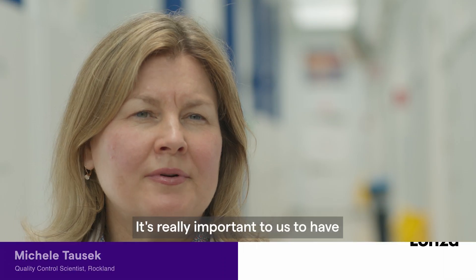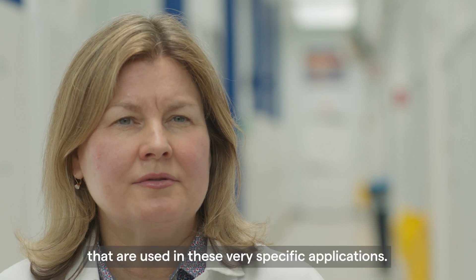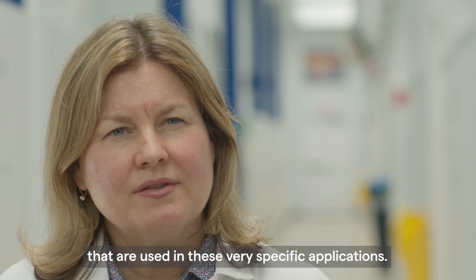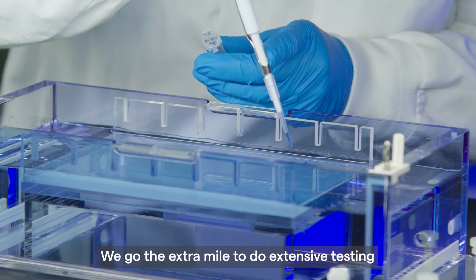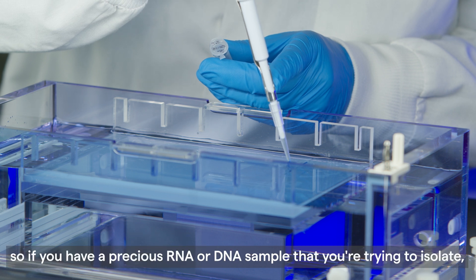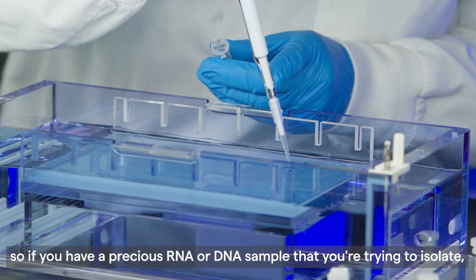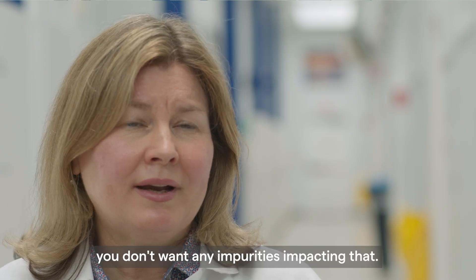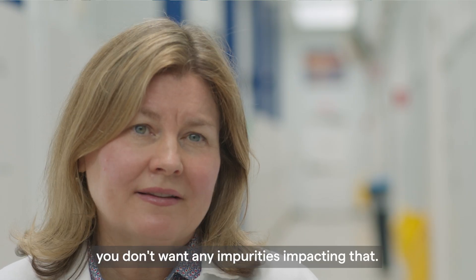It's really important to us to have high quality agaroses used in these very specific applications. We go the extra mile to do extensive testing to provide genetic technology grade agarose products, so if you have a precious RNA or DNA sample that you're trying to isolate, you don't want any impurities impacting that.